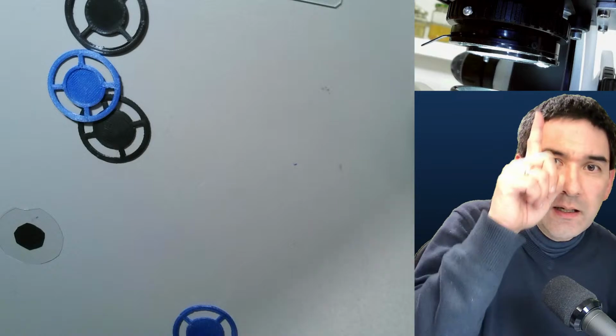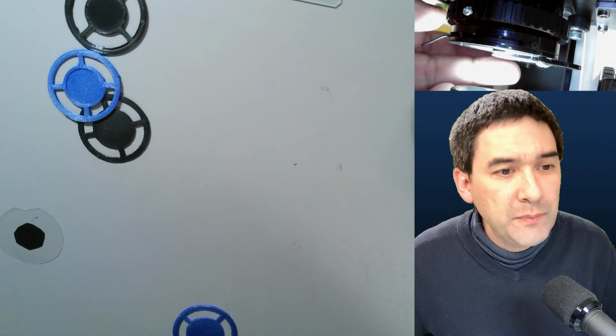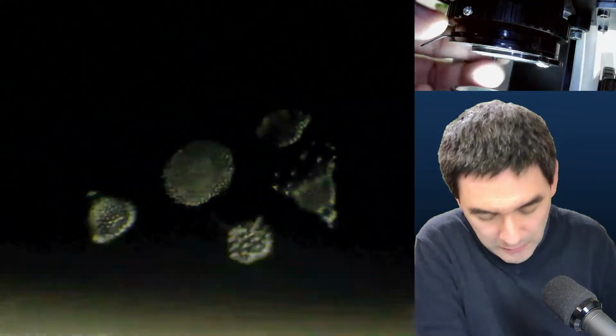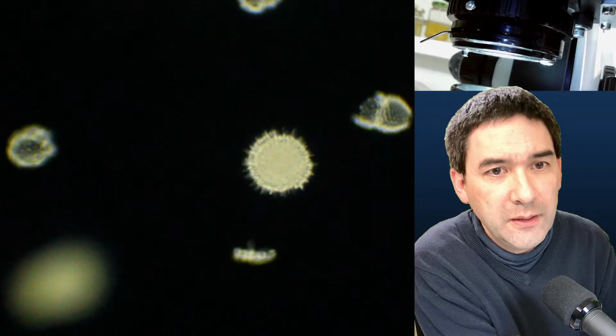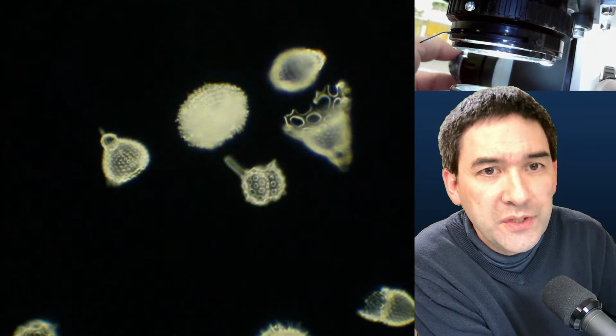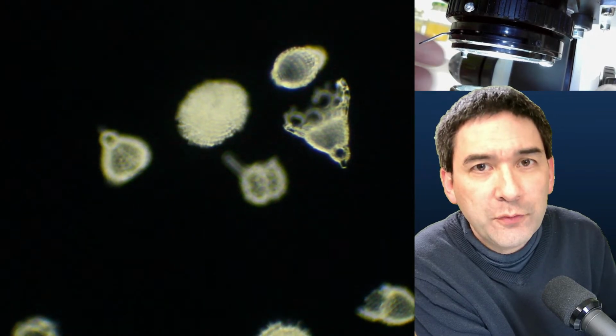So basically up here you can always see what I'm doing, right? I'm rotating out the filter now, and I'm going to just switch over. Oh, I took it out, okay. So let's put this filter, this one over here, back in again. That's basically the image that we just had, right? And generally, you might notice that the depth of field is fairly low, and the reason is because you have to open the condenser all the way.